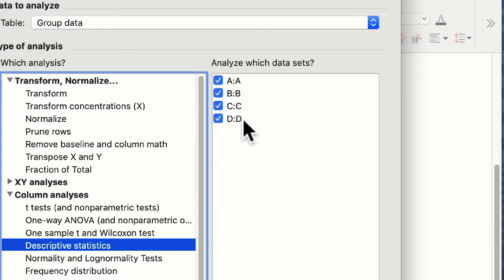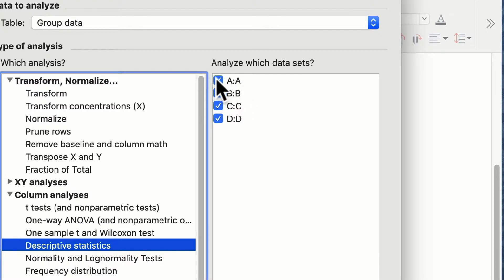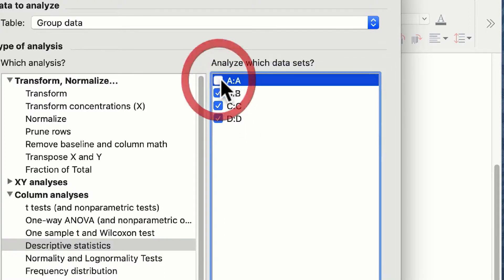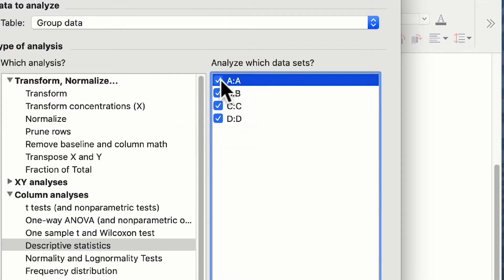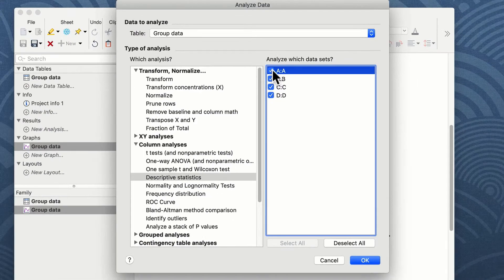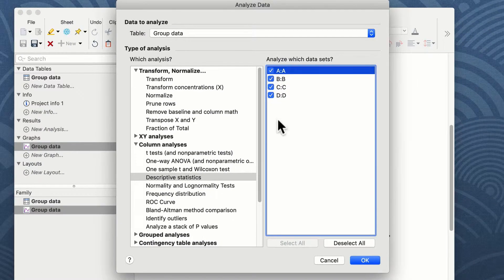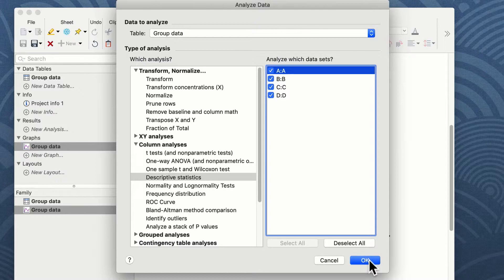If you have more columns representing, for instance, different experiments that you don't want to show these statistics for, you can deselect them simply by clicking on the little boxes next to each of the column headers. Having selected your data set, you click on the OK button.